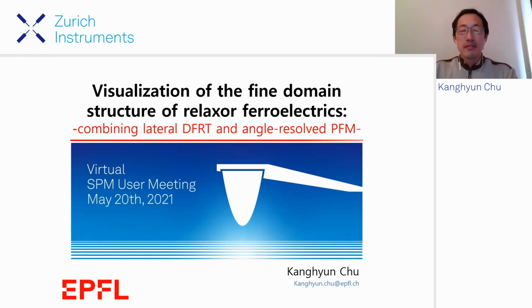I'm working in the EPFL with Dragan, and today's topic is the visualization of the fine domain structure of the relaxer ferroelectrics. This is basically a collaboration of the conventional DFRT lateral PFM and image processing. So I'm going to guide you to the kind of backstage of what's going on behind the images. Okay, let's move on to the basic principles.